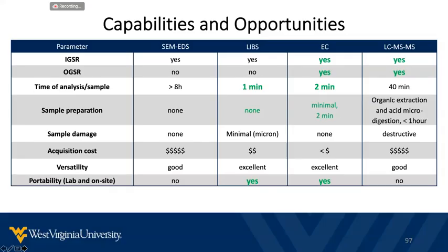Unfortunately, there is no technology available that can match the speed for detection of gunshot residues. So law enforcement have to wait weeks to months to get a pretrial result, and electrochemistry and LIBS have really a potential to change the way we do that type of investigation.